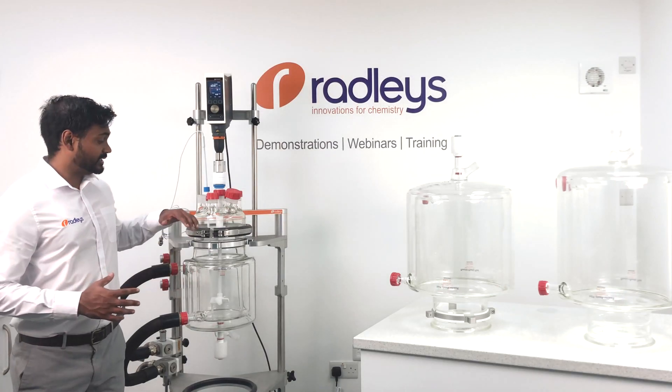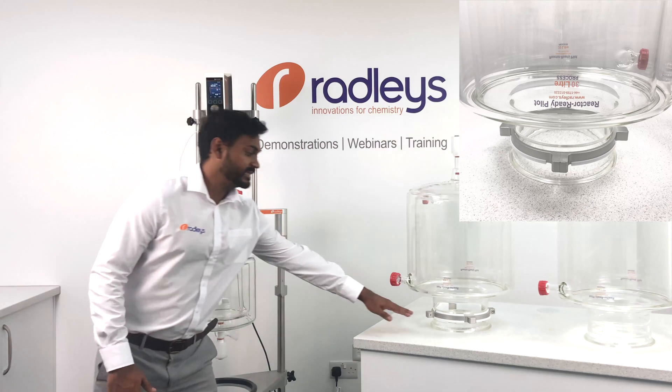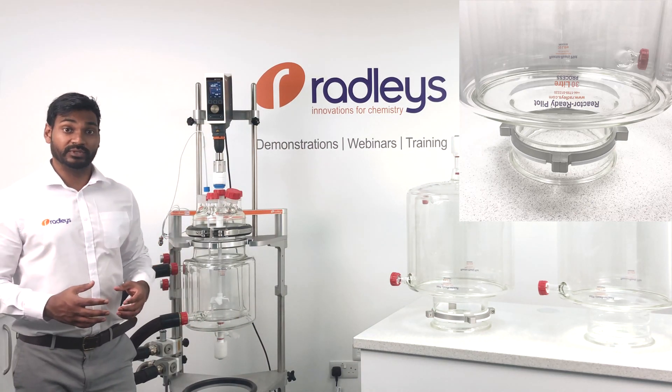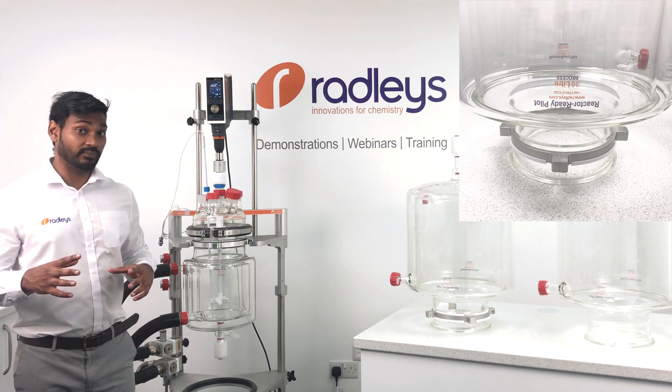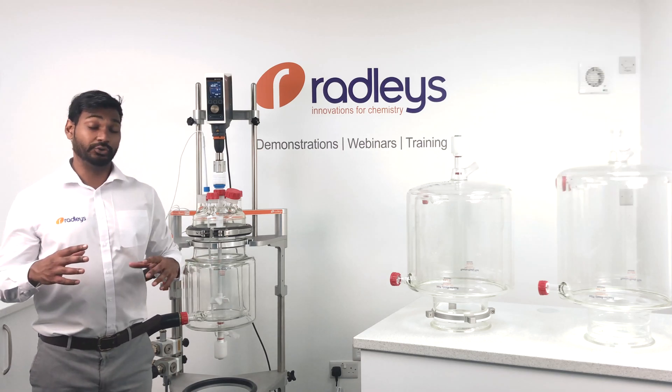All our vessels have the same size DN200 flange and locate into the frame with this vessel collar, eliminating the need for any adapters when swapping between vessels of different sizes. I'll now show you how easy it is to swap from the 5L vessel we have in the frame at the minute to the new 30L vessel.